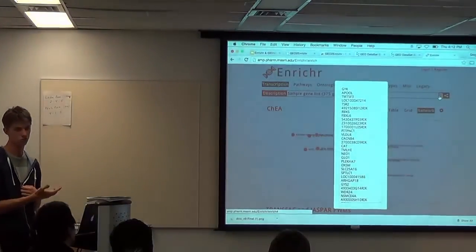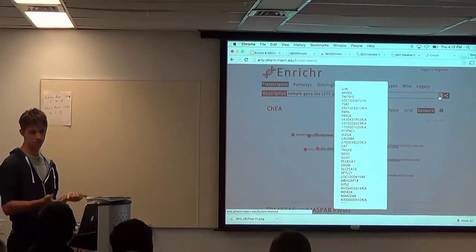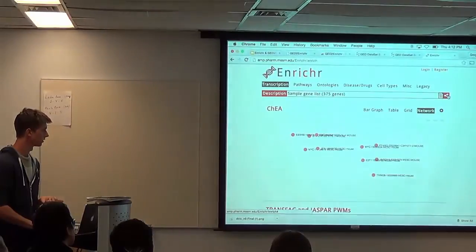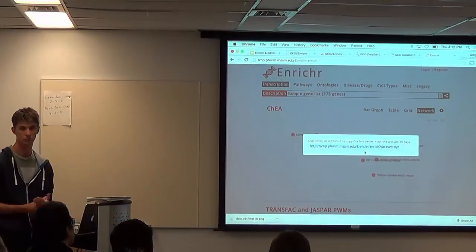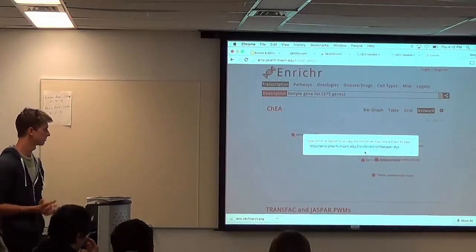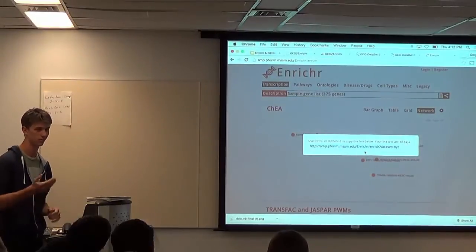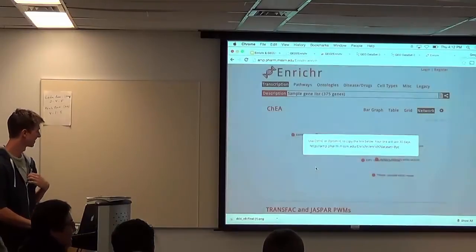This is how you would view the gene list produced by the bed file conversion. We can also share the gene list by creating this link, which we can then send to our friends. It says it will last 30 days, but that isn't true. It lasts forever, and I've yet to update that.